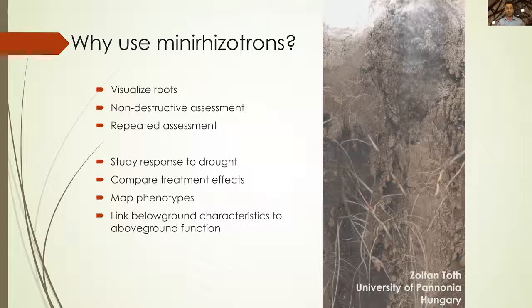Minirhizotrons have been utilized to study, again, plant response to drought conditions, compare treatments over time, and, my personal favorite, map phenotypes to genotypes, and overall find correlations between below ground characteristics and above ground function.